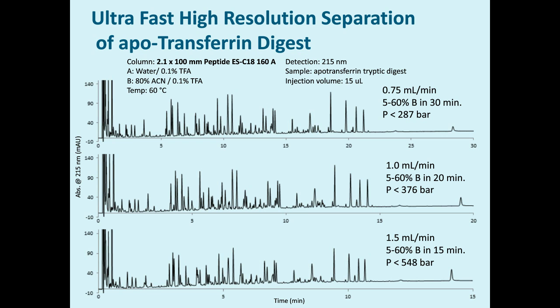And if you compare the resolution and peak capacity or ability to resolve this complex mixture across these aggressive flow rate conditions, faster separation time, you can see that there's relatively limited degradation of the resolution capability.